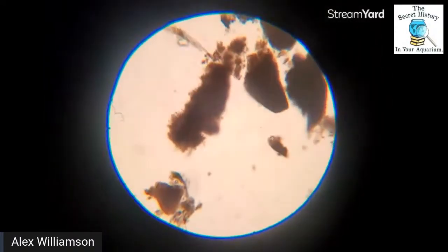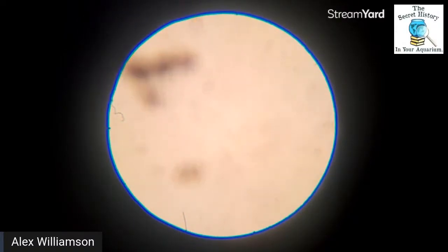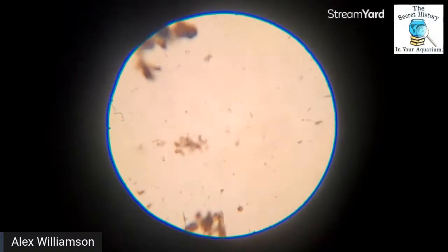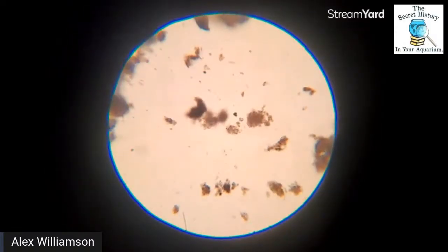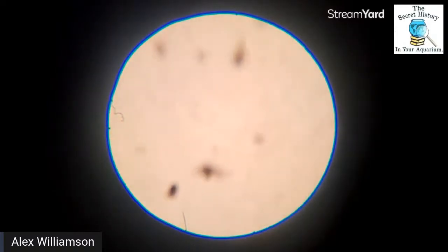And this was from the mulm of the very planted tank. So again, these are little cysts or seeds, little cells that don't move, that are perfectly round, and you can see the margins on them really well. They could be spores, but they're usually little seeds or cells, or rather cysts. Brine shrimp have cysts, for example. Those two little circles up towards the top, well, now they're gone, are probably something that was dormant in the substrate, and it will hatch in several months. All right, let's look through some more of this, and then we'll load up.